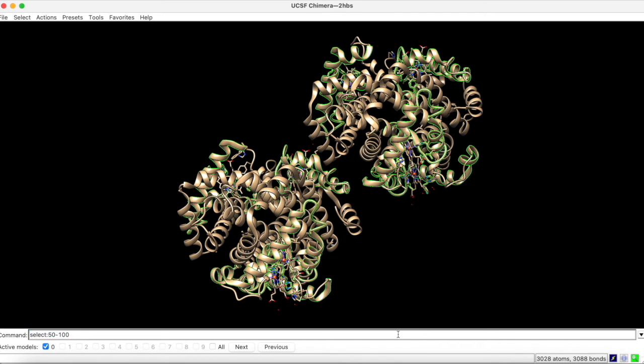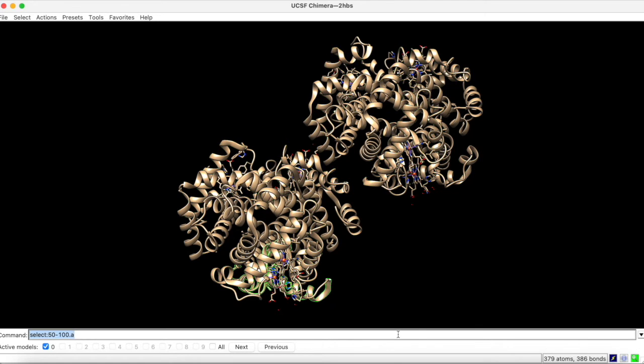If you wanted to limit the selection to a particular chain, you would type a period followed by the desired chain code. Now the selection only applies to chain A.